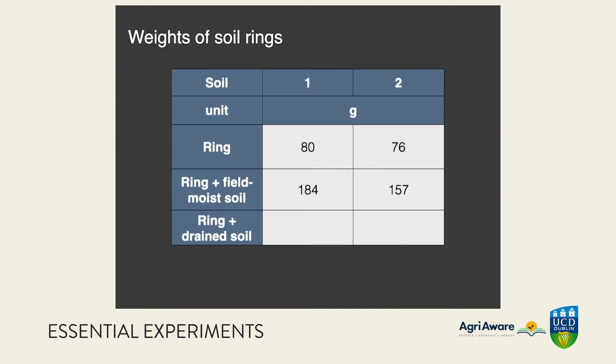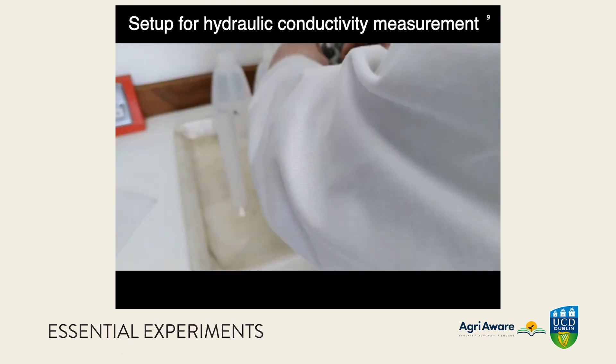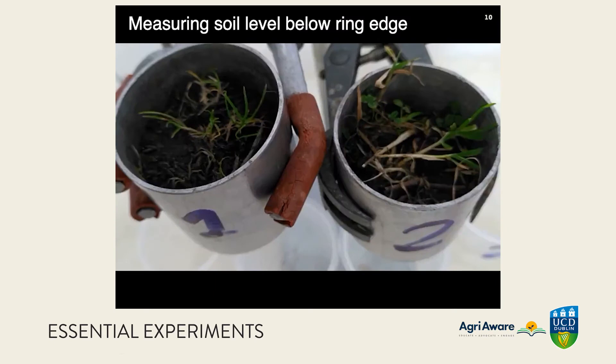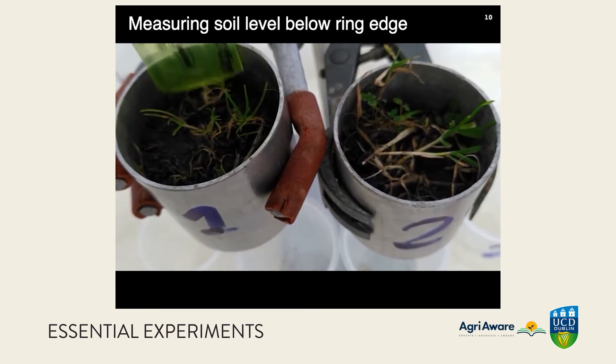From those numbers we can get the weight of the field-moist soil by subtraction. Setting up for the hydraulic conductivity measurement involves putting the rings into the clamps over some beakers. We need to know the depth of the soil below the edge of the ring — measured here fairly crudely to the nearest millimeter.